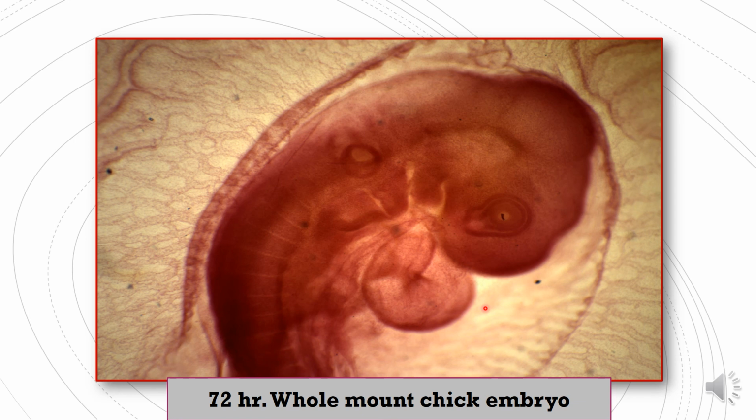And next slide, 72 hours, also a whole mount of the chick embryo. This slide shows more development of the heart tube.